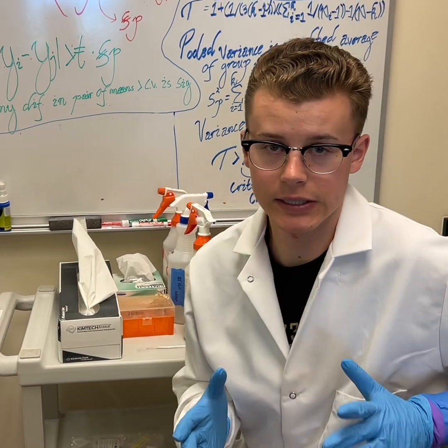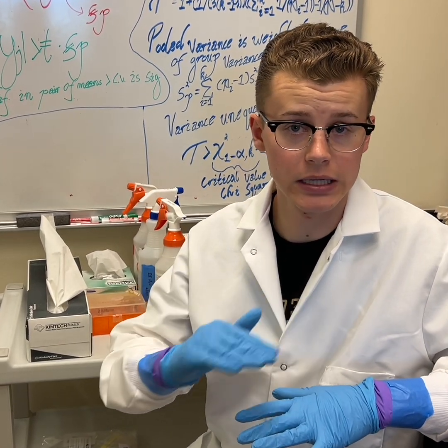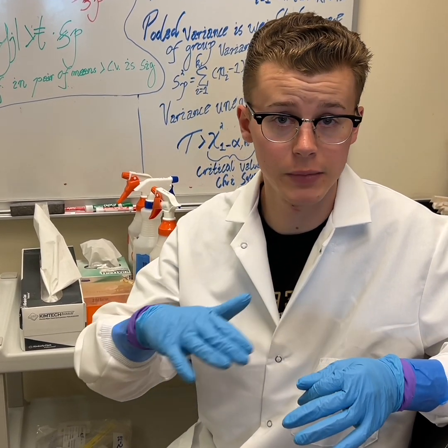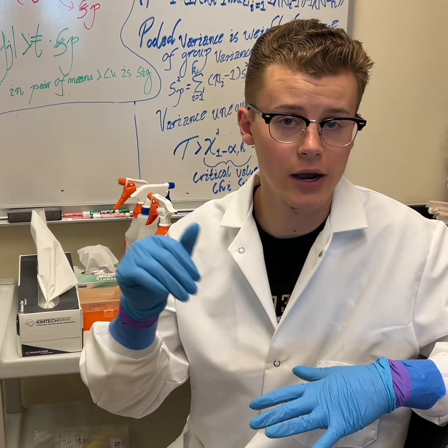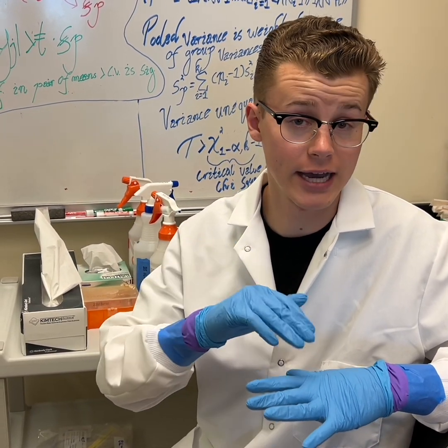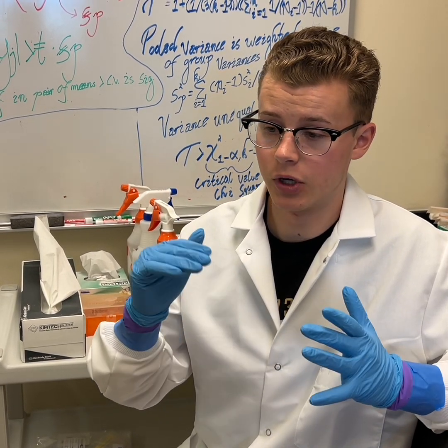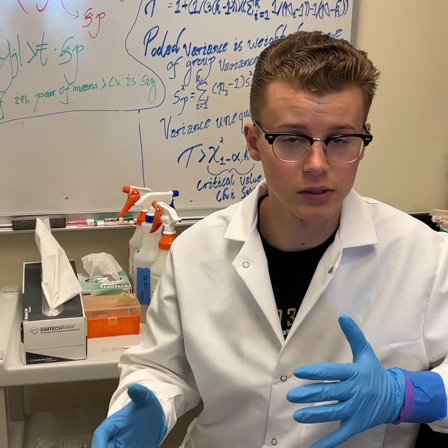What this step is going to consist of is we're going to aspirate the media that's left over from the homogeneous cell mixture that we seeded into the plates. So we're going to take that out. It's going to be about 80 microliters without disturbing the biofilms at the bottom of the wells. And then we're going to add 300 microliters of PBS and wash 2 to 3 times.